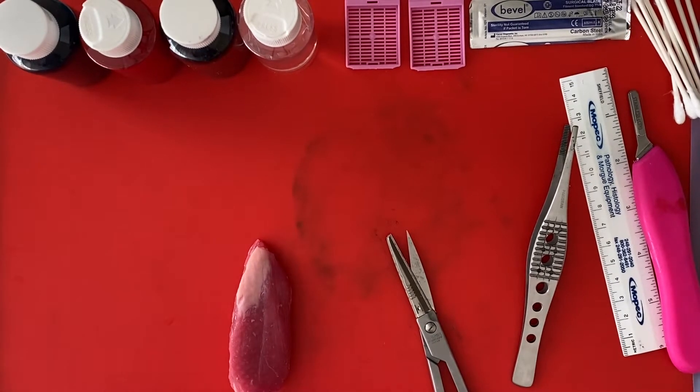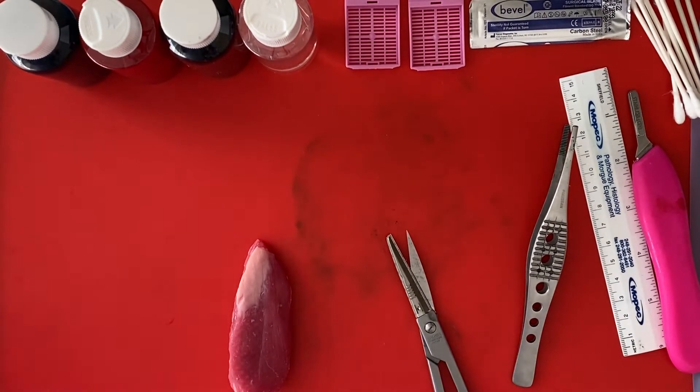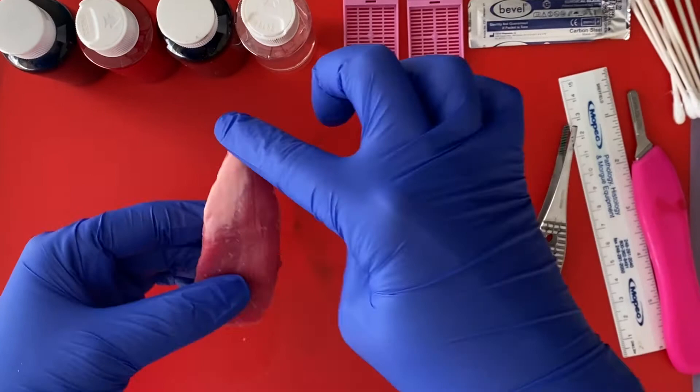We're going to first start out with doing our right lobe of the thyroid. The very first thing that we're going to do with our lobe is orient it. If you remember, the thyroid lobe tapers on the superior aspect, and our isthmus margin is going to be medial. Whenever I'm grossing, I like to lay the specimen as though it's inside of me, so I'm going to have this be superior.